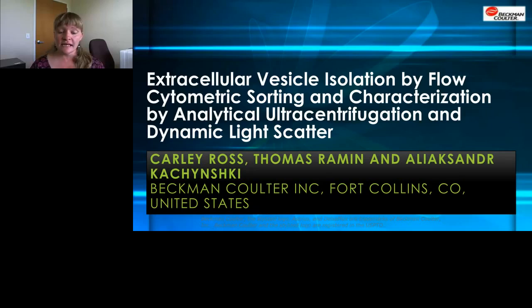Thank you, Chad. Today I'm going to be discussing extracellular vesicle isolation by flow cytometric sorting and characterization by analytical ultracentrifugation and dynamic light scatter. I worked in collaboration with two scientists, Dr. Thomas Ramin and Dr. Alexander Kaczynski at Beckman Coulter Life Sciences Research and Development in Fort Collins, Colorado. I will review three different topics in this presentation. Flow cytometry and extracellular vesicles. Can your system really see EVs? I will also discuss bulk and single EV isolation, and then finally focus on analyzing EVs with current and new techniques.